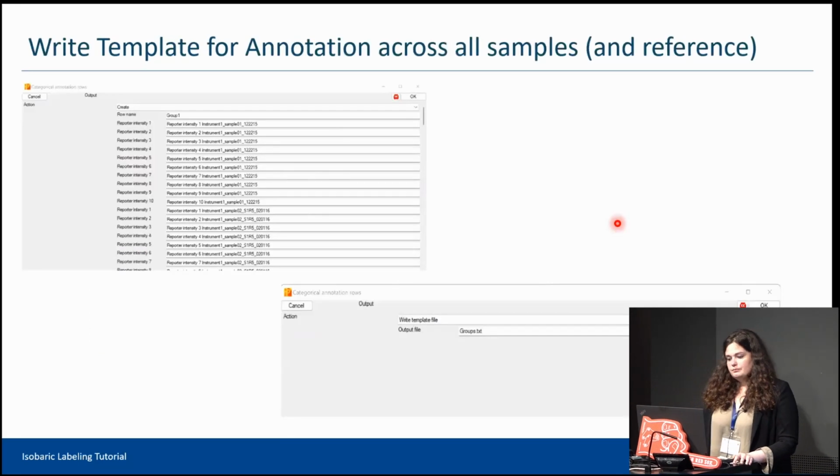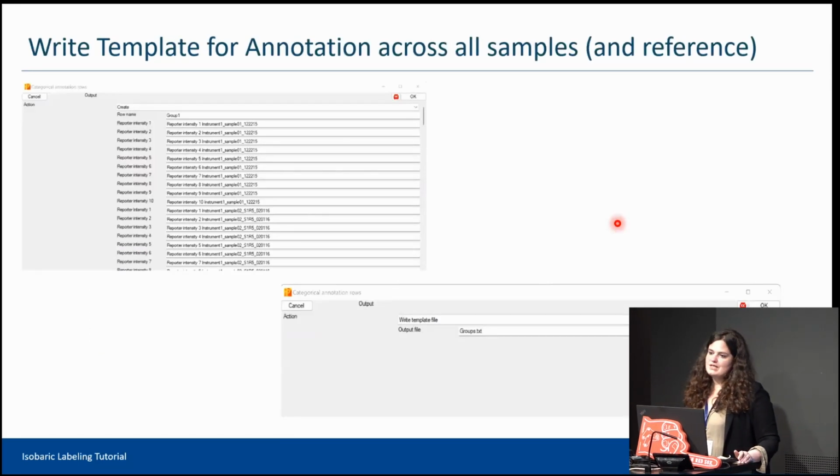But what we need to do also is say to Perseus, again, we need to include an annotation. We need to include an annotation because we need to tell Perseus the reference channel, the sample channel. So again, we have to take this metadata that they should provide together with the paper, of what that sample channel is, so which tissue, which cell line you have in that channel, if that one is a reference channel, if that channel is empty. So all kinds of information that you need.